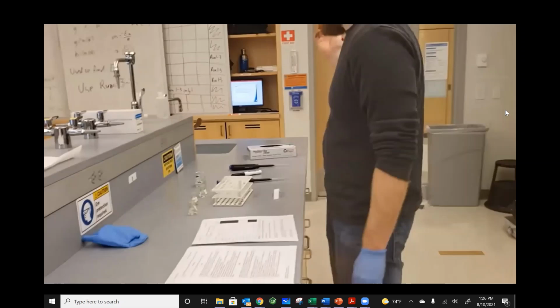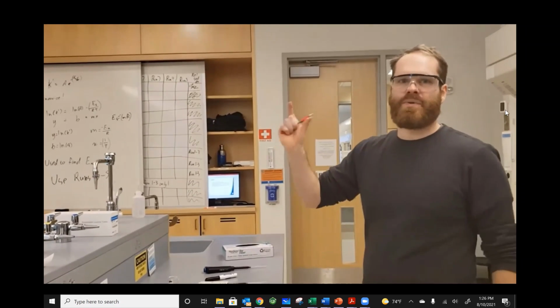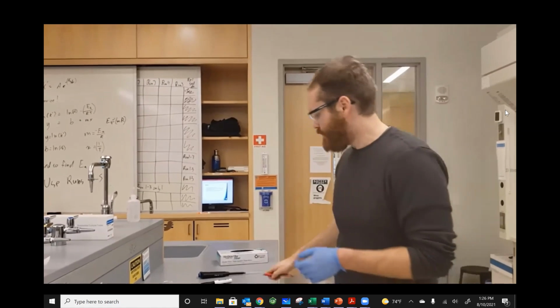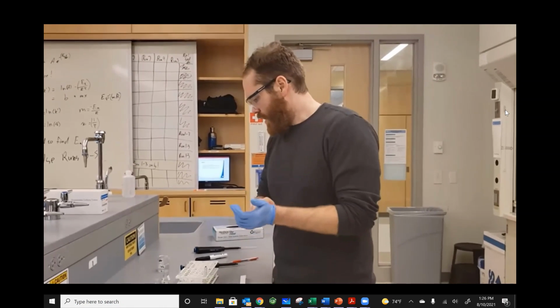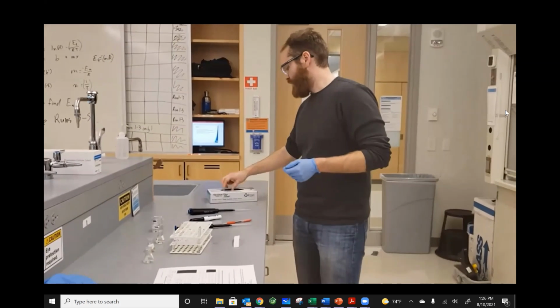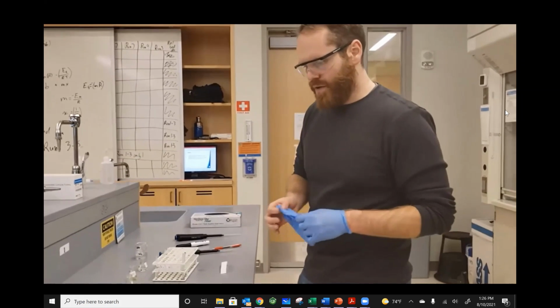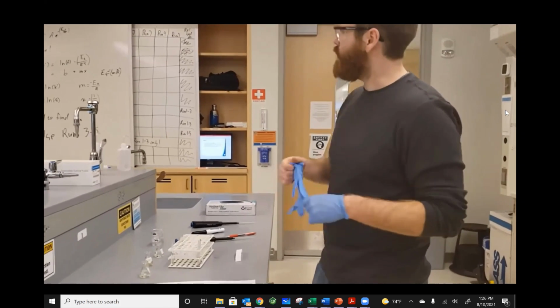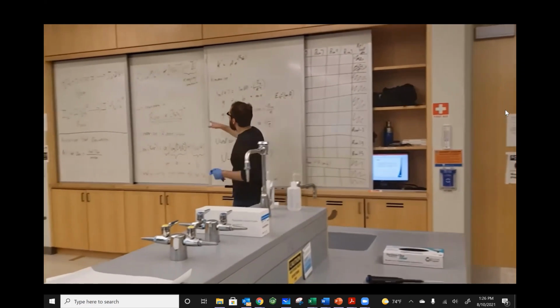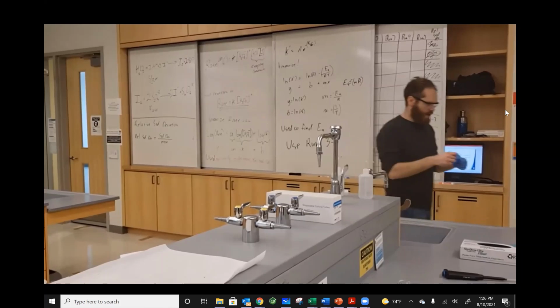And perfect. But now, see, because of the way that I was holding the test tube, I was applying body heat to it each time. So that is just one of the very valid sources of error. All right, so now we're going to move on to our temperature trials. You now have all of the data you would need to figure out your order of the reaction. By order of the reaction, we remember when we're trying to solve a rate law, the order of the reaction is just this exponent up there.